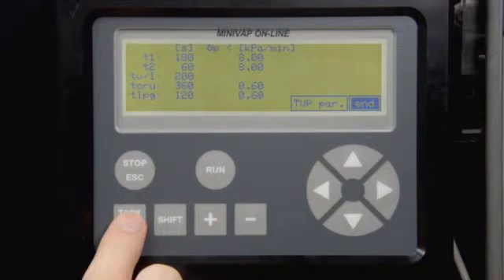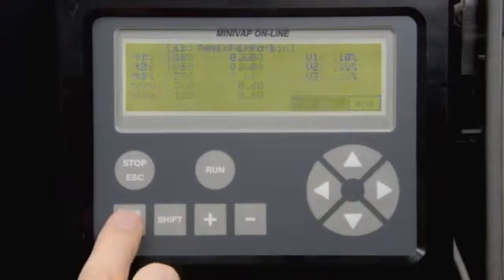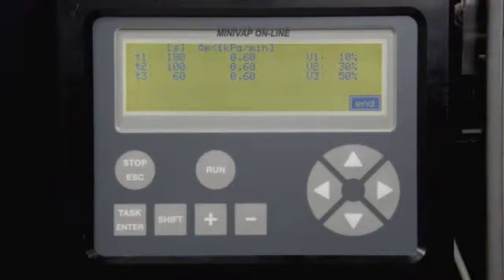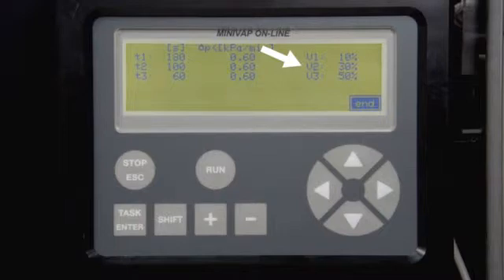To change the settings for TVP measurement, go to TVP Par and press Task. Here, equilibrium times and measuring points for TVP measurement can be adjusted. The TVP measurement will test three different V over L ratios and extrapolate to a V over L ratio of zero. This method has been verified on a large sample set of crude oils.